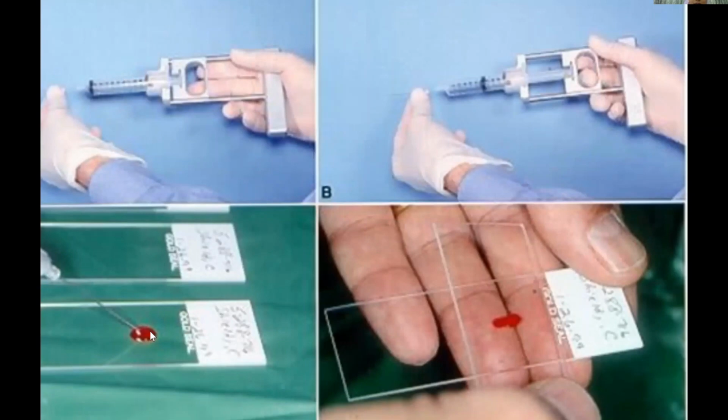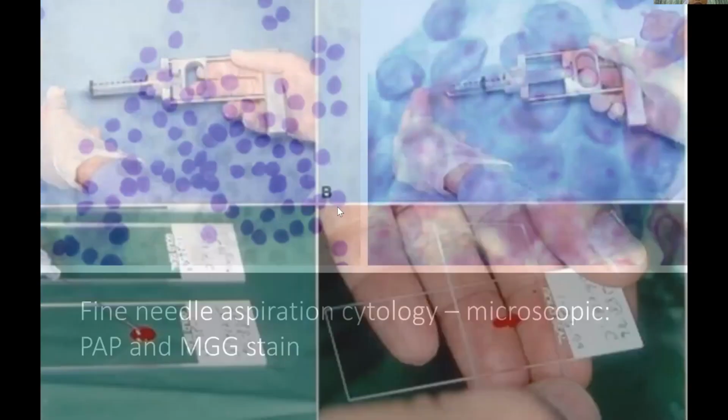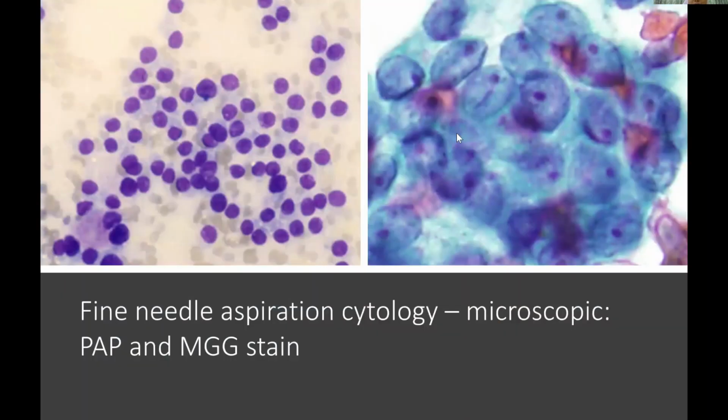After smearing, we stain. For FNA, we have two types of stain. Pap stain, this is a Pap stain. And this is a Giemsa stain, the MGG stain. For Pap stain, it is more useful to look at the nuclear features. You can see clearly the nuclear features.